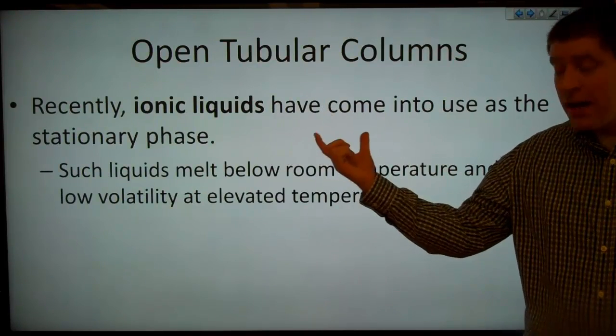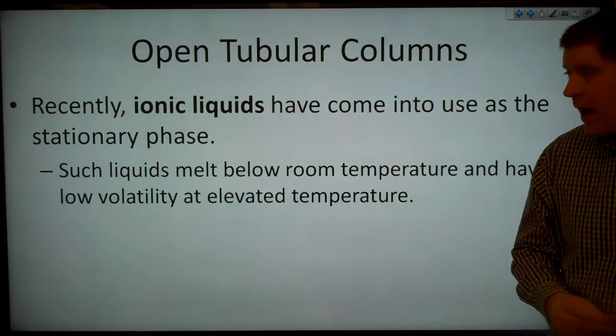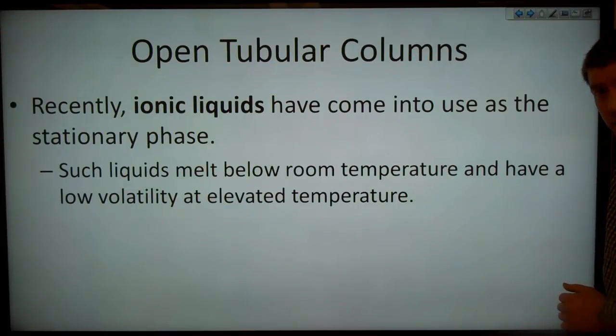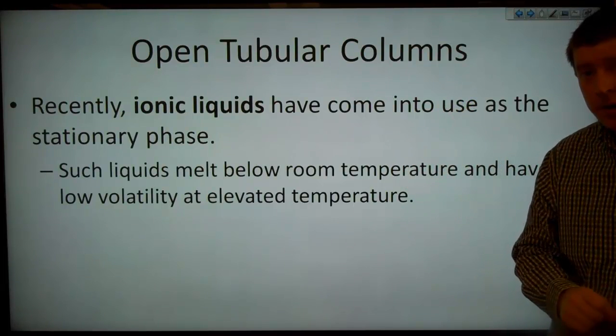So recently, ionic liquids have come into use as a stationary phase. And these liquids melt at low room temperature and have a low volatility at elevated temperature. And then, of course, because they're ionic, they have very high polarities.